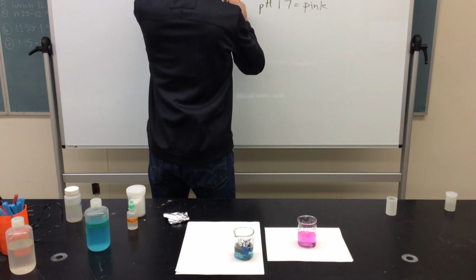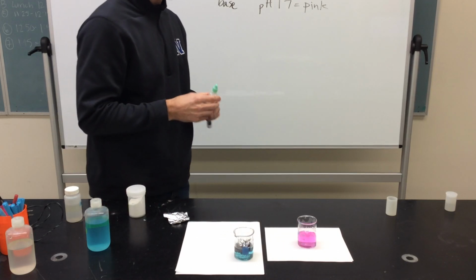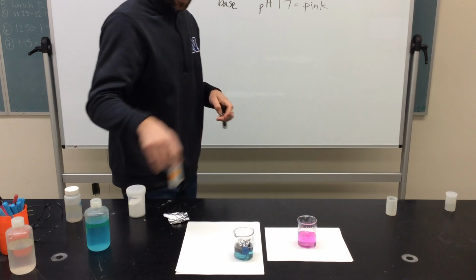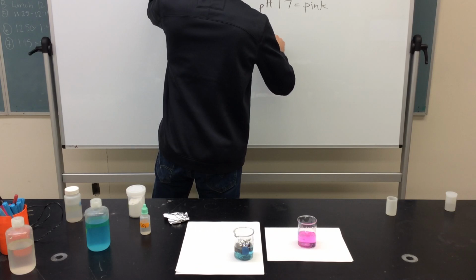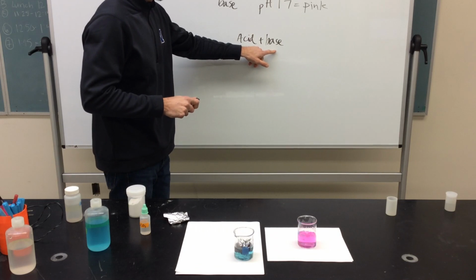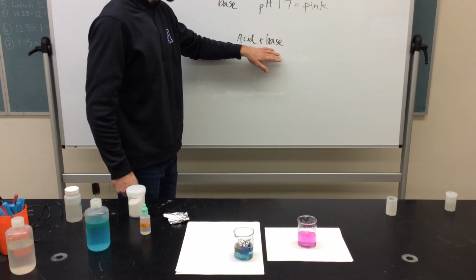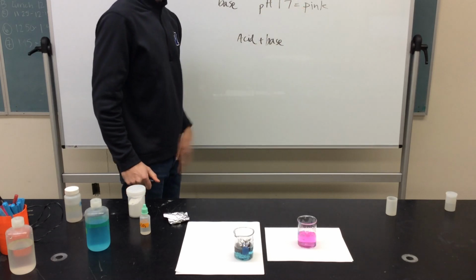This is an acid. This is a base, right? So it was clear when it was in the hydrochloric acid by itself, but when we added a little squirt of sodium carbonate, it showed up, right? Because we put a little bit of base in there. And so we were adding acid and base together. When we had a lot of acid and just a little bit of our base, eventually the base would disappear. And that's why it became clear. Until we added enough base that we had more base than acid. And at that point, it stays pink.